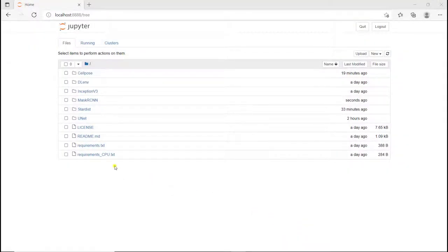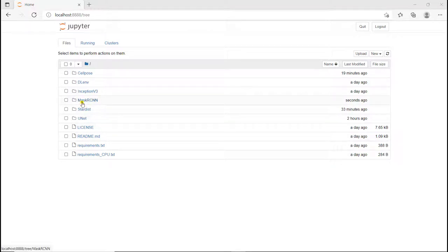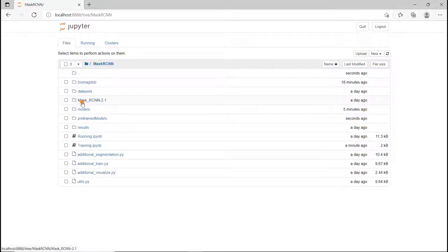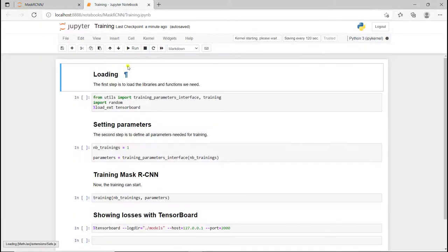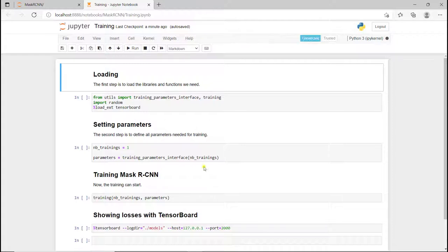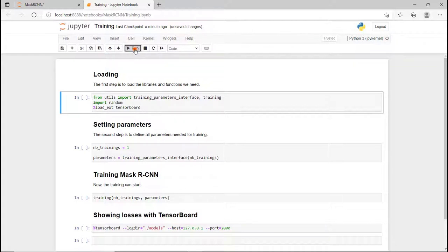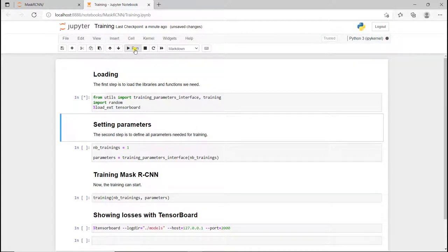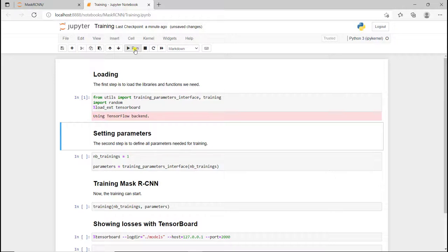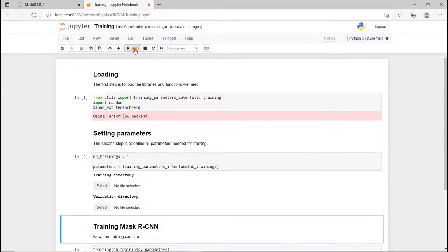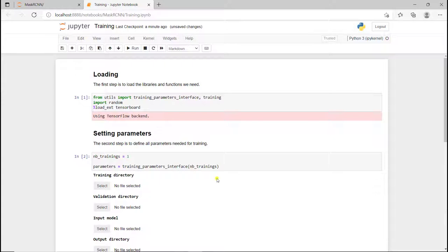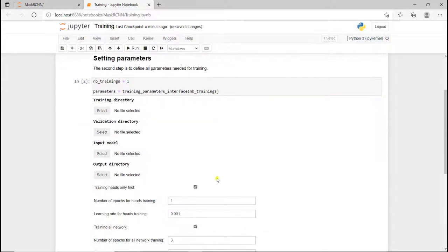I'm going to go in the Mask R-CNN folder and then we have a bunch of folders. The important ones here are training and running. I'm going to open the training notebook and it's organized the same way.